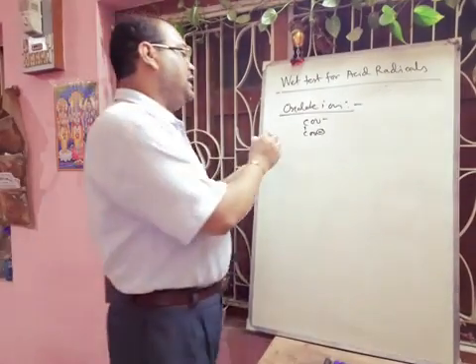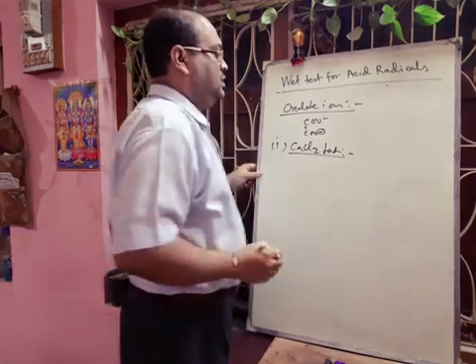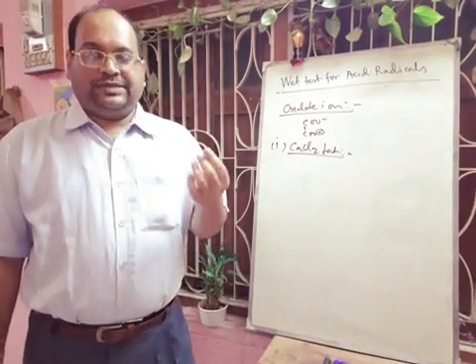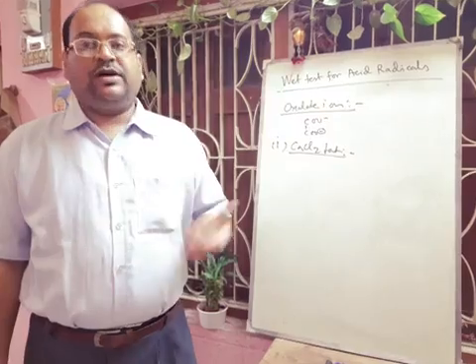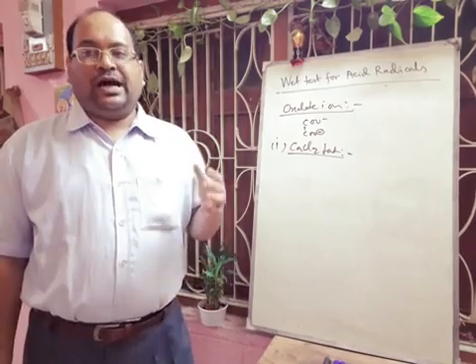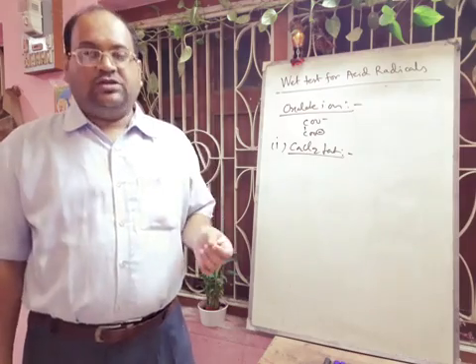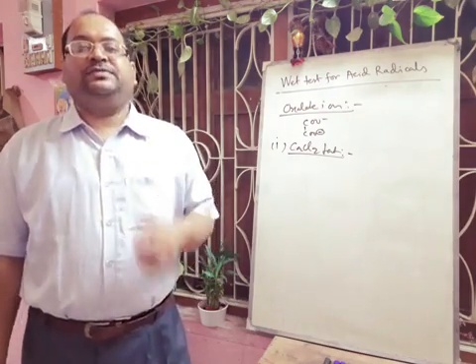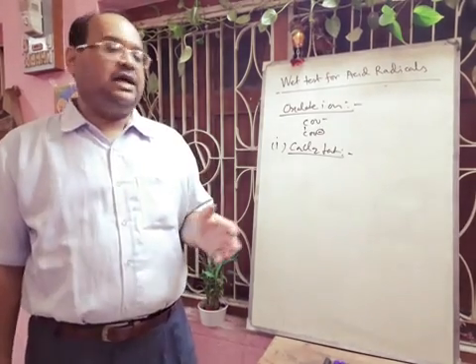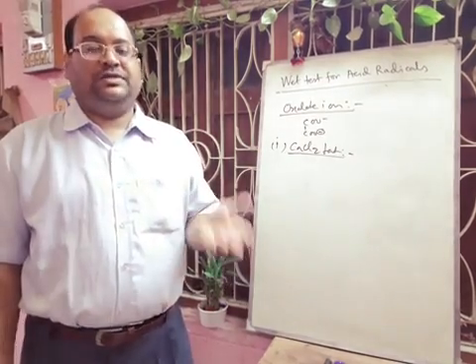First we have to do the calcium chloride test. We take the sodium carbonate extract, acidify it with dilute acetic acid, and boil off the carbon dioxide. Then cool, and if you add calcium chloride solution, you will get a white precipitate which is insoluble in acetic acid. In this way you can confirm that your sample contains oxalate ion. Actually, calcium oxalate is forming. This is a white precipitate.